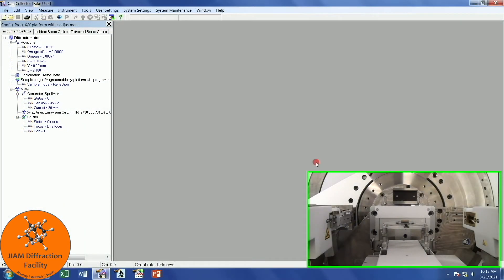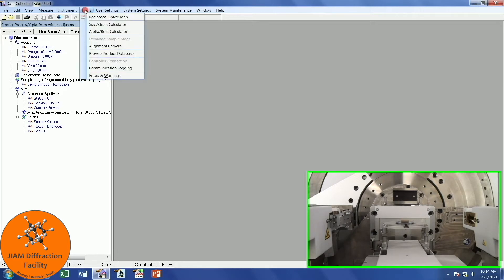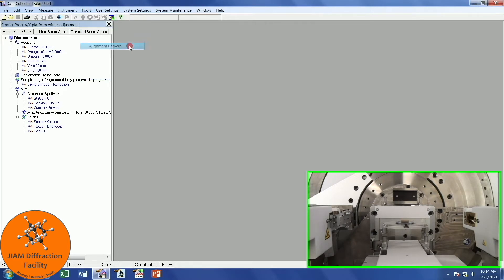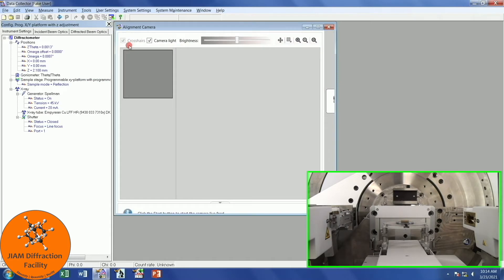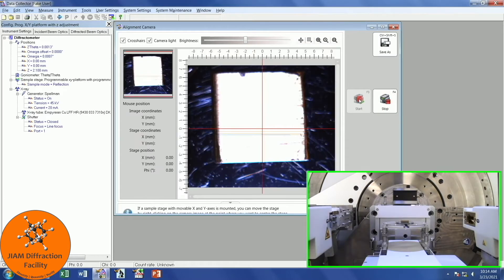The first thing that I like to do before I forget is to align the sample in X and Y. X is left to right in the sample chamber, Y is front to back, and Z is up and down. In the GIAM diffraction facility, we have an alignment camera placed above the sample. In order to access that, we go to tools and choose alignment camera. Let me make this a little bit bigger and left click start.